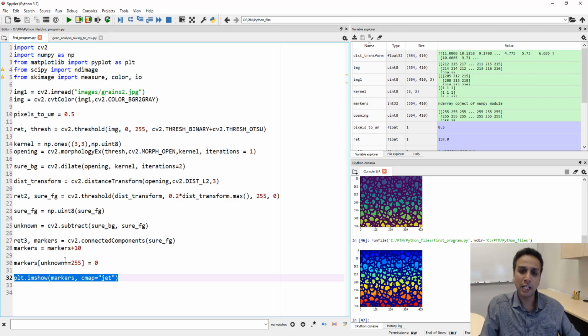Okay. And by the way, I structured this tutorial based on a different tutorial that is part of, I believe, the documentation for Watershed. Again, I looked up 5-6 different sources, and then I'm putting everything into one. So if some of the steps sound very similar to the documentation that you're reading right now, there is a reason, because I really am not trying to invent something new. I'm just following something that's already out there.